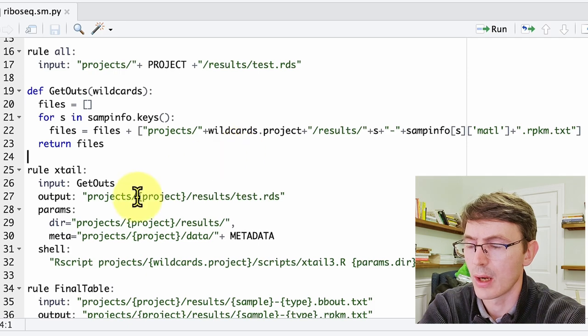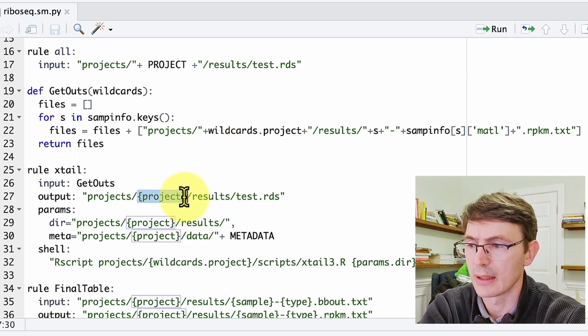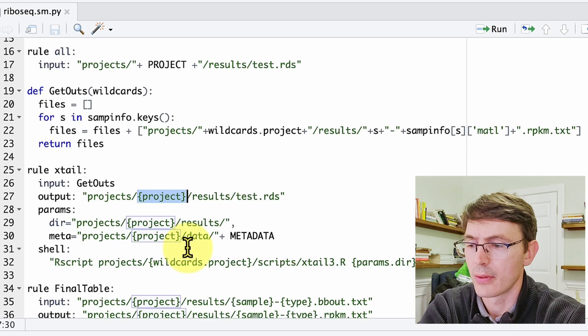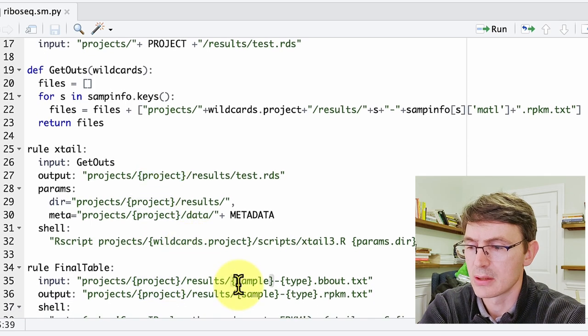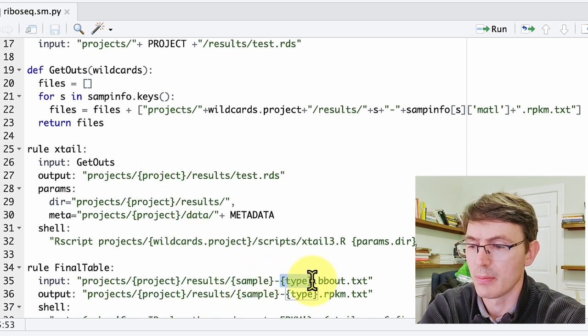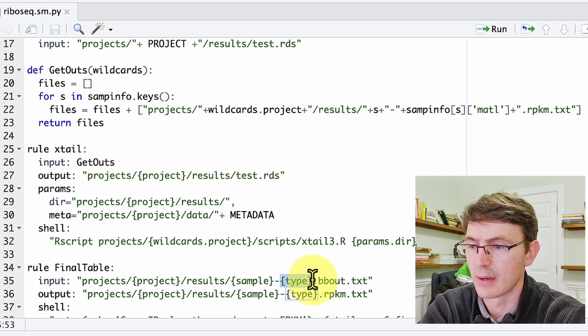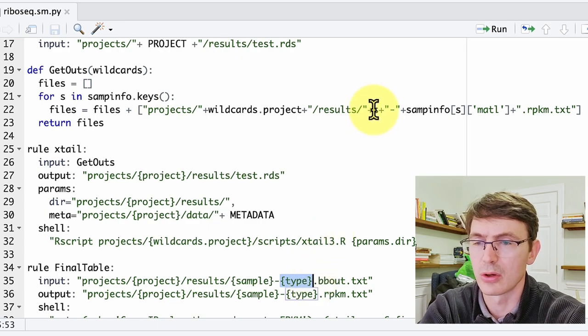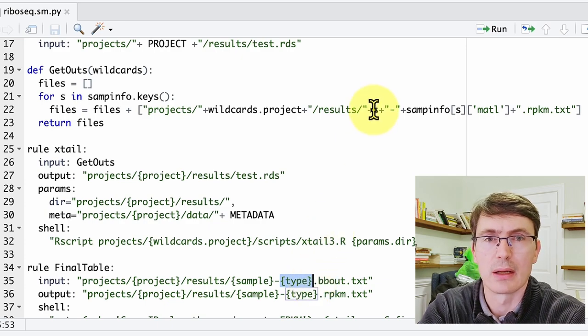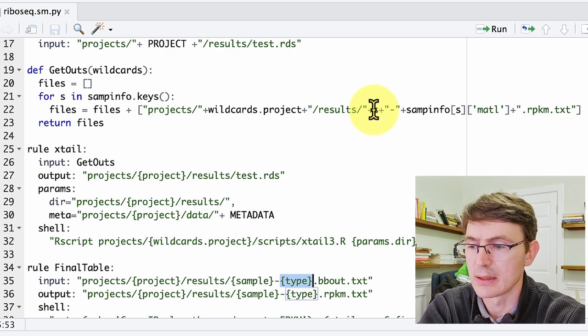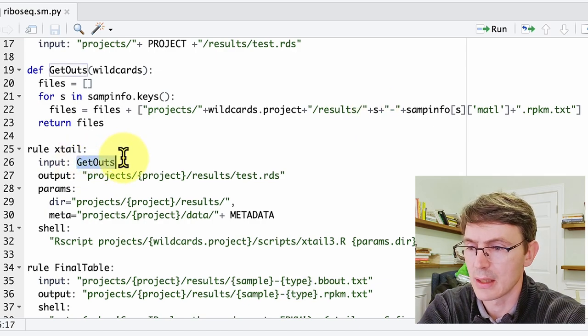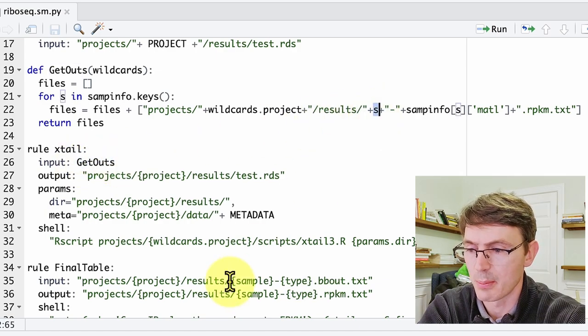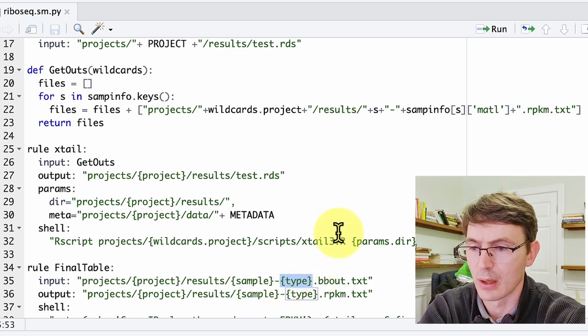For the next steps, these wildcard samples and sample types will be defined by this other function. So they are not—not all of the wildcards are defined by the rule all. In this case, the input from the xtail will be defining this sample wildcard and this type wildcard over here. So now if we go and run the pipeline, here we're doing a dry run, we see that we generated all those inputs for xtail.